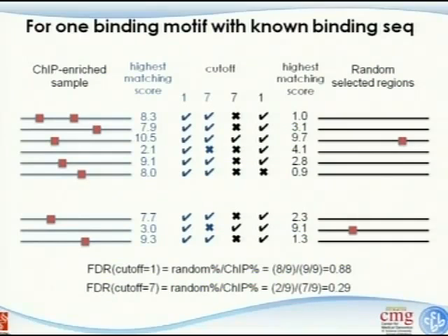Initially, we randomly selected some regions just genome-wide, anywhere, not near any gene, and I picked out those regions. And we initially found many different motifs, not only the ones that I listed there. Once I looked, I started to really doubt it. This is not possible, but their scores really looked good. And then when I further looked, I found a lot of those binding sites are CG enriched.